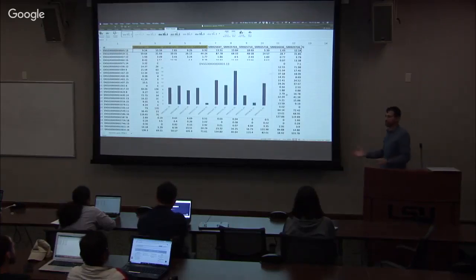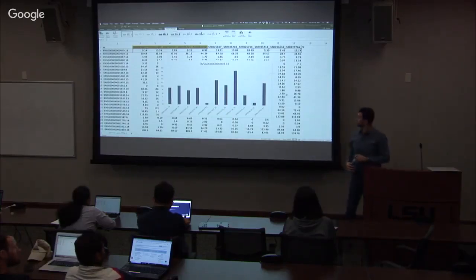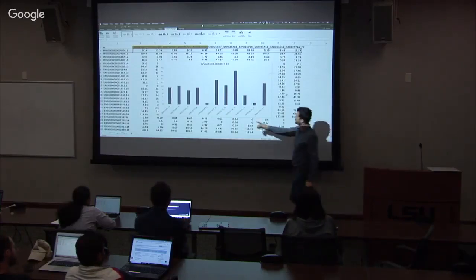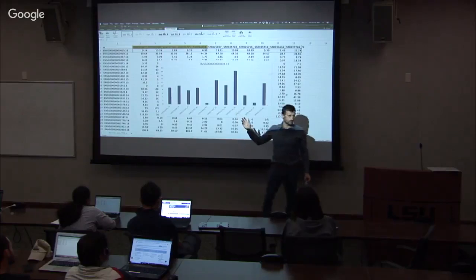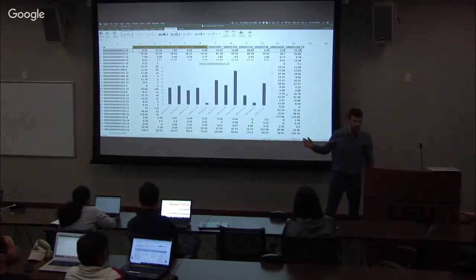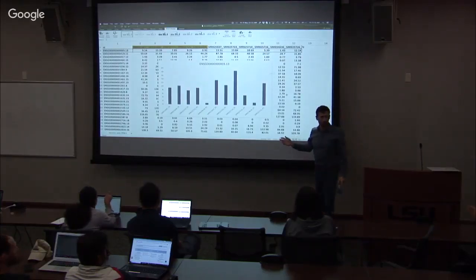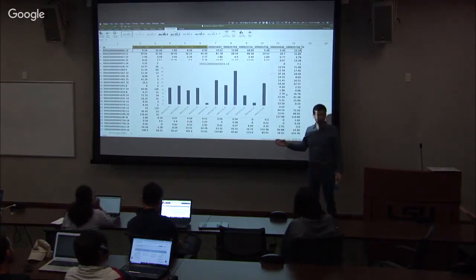What do you think? Which group is more highly expressed than the other? These are higher. By how much? If we take the average, we need to find out, because in some cases it's very low, like 636 is very low, 17, but there is a very high one, like 714.